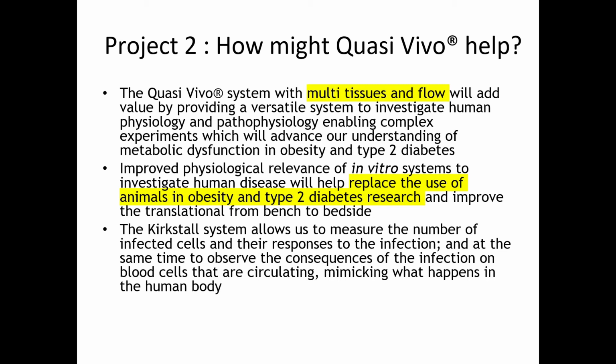Once you've got that in vitro model, of course, hopefully you can scale it up and translate any new methods and assays from the research bench into a higher throughput test. So if you like, the initial Lego kit is a proof of feasibility, but what will be interesting is that with any of these models that are successful, we aim to scale them up so you could have multiple chambers in parallel, and really have a good model that mimics what happens in the body, but also scale up the number of tests you can run.